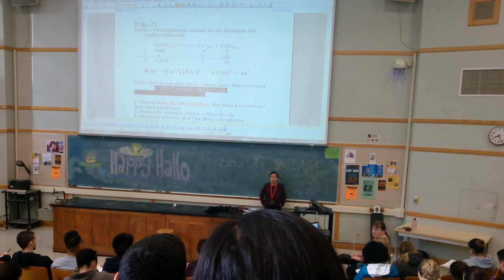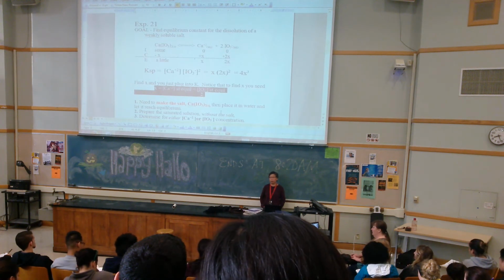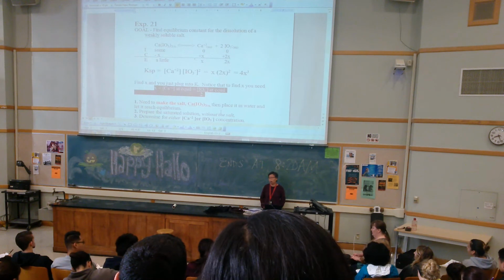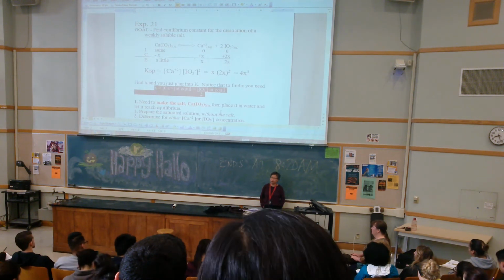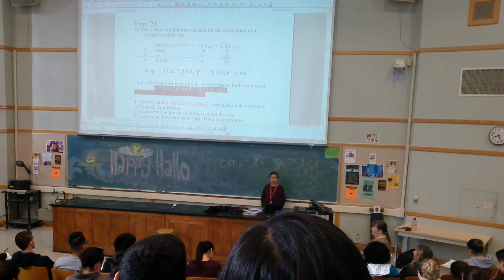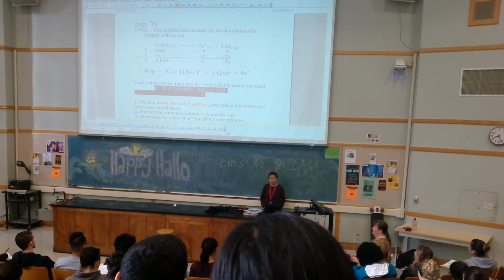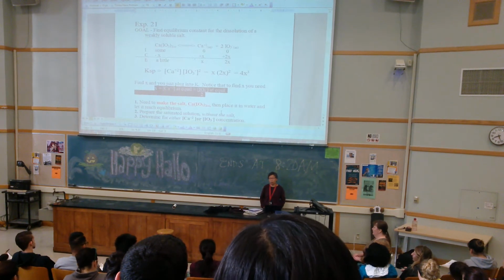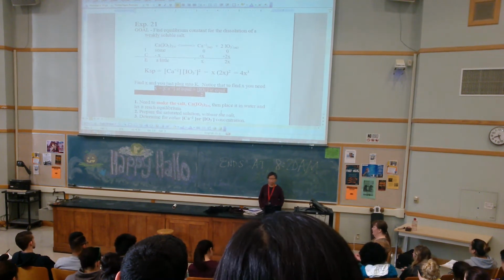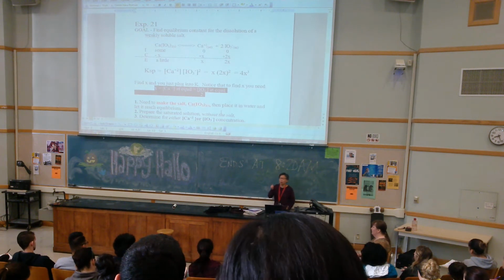First step you need to do is to make your calcium iodate salt. You will be preparing that in the lab, okay? Because you will be needing to make a saturated solution of it. So the lab manual will tell you how much of calcium and iodate in solution they'll be provided. You're going to mix them up. You first make the salt.